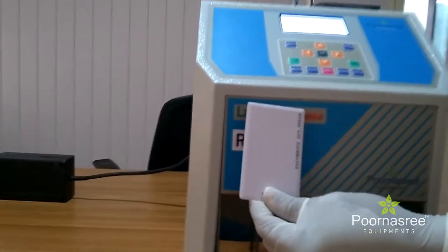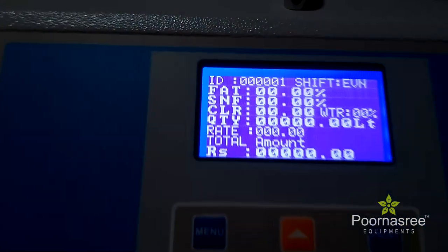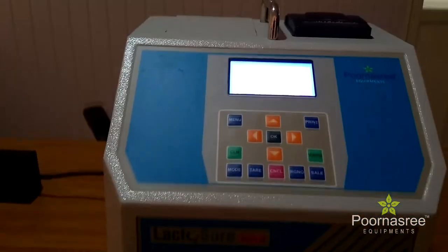The next process is to identify the farmer. For that, cite the card of the individual farmer. The machine has automatically identified the farmer now.